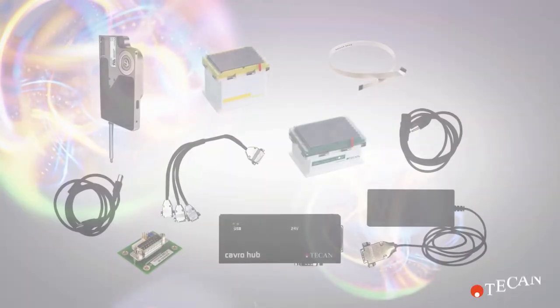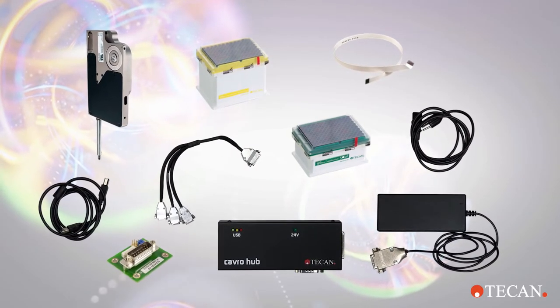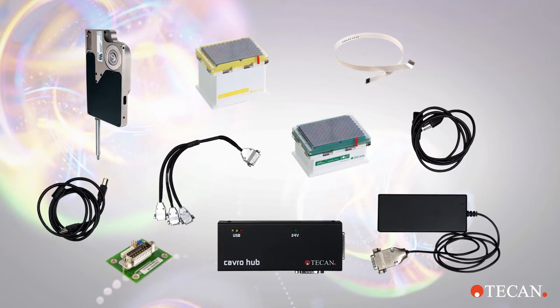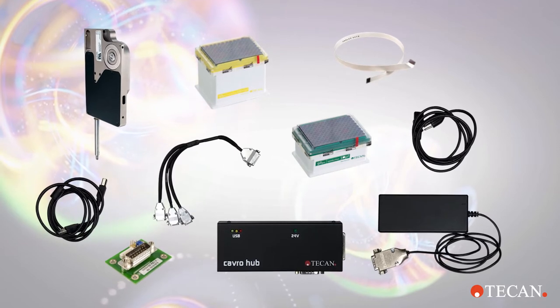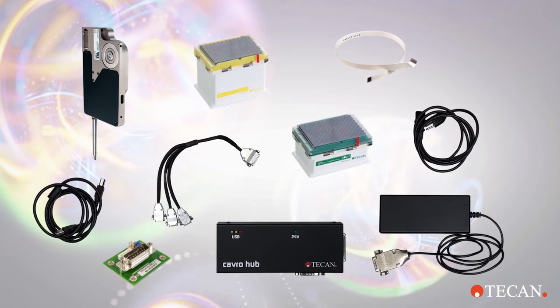Open the box carefully to make sure you don't damage any contents. Then carefully unbox the individual components that make up the ADP Starter Kit.